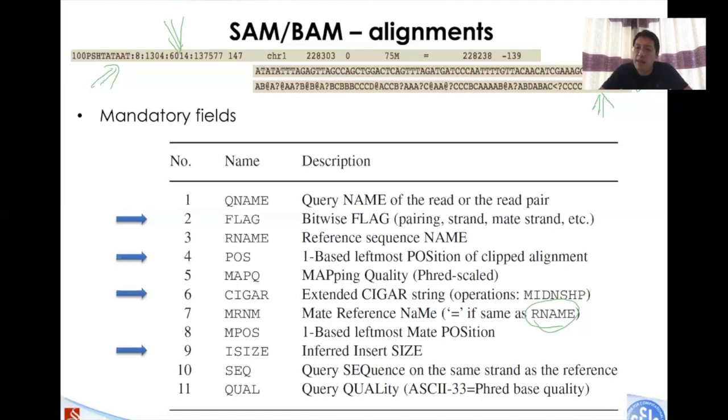So sometimes people stop storing FASTQ files, because FASTQ files are in text format and take a little more space. Some people just convert that into the BAM file, which is a more compact binary format, and then distribute the BAM file. That is quite a normal practice in recent days. And there are specific tools that you can use to convert the BAM file into the FASTQ file.